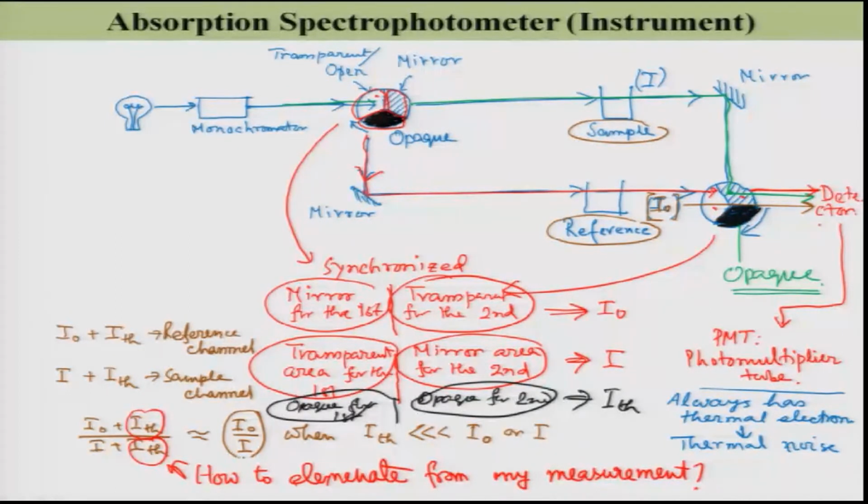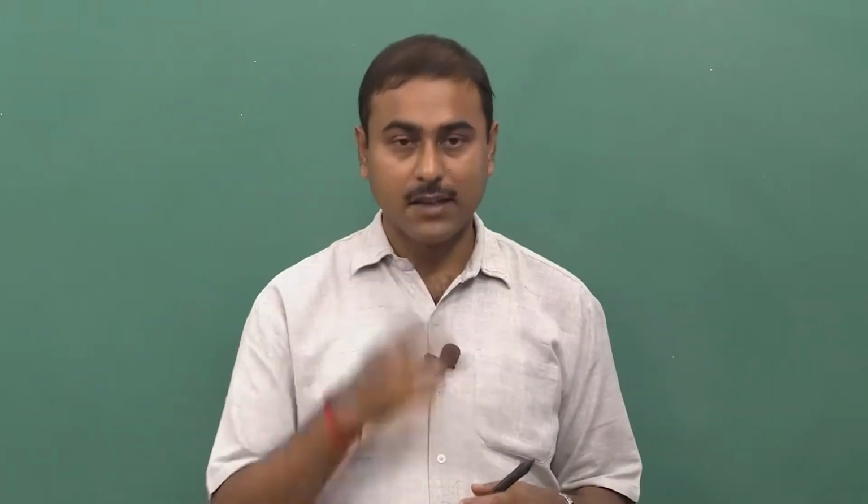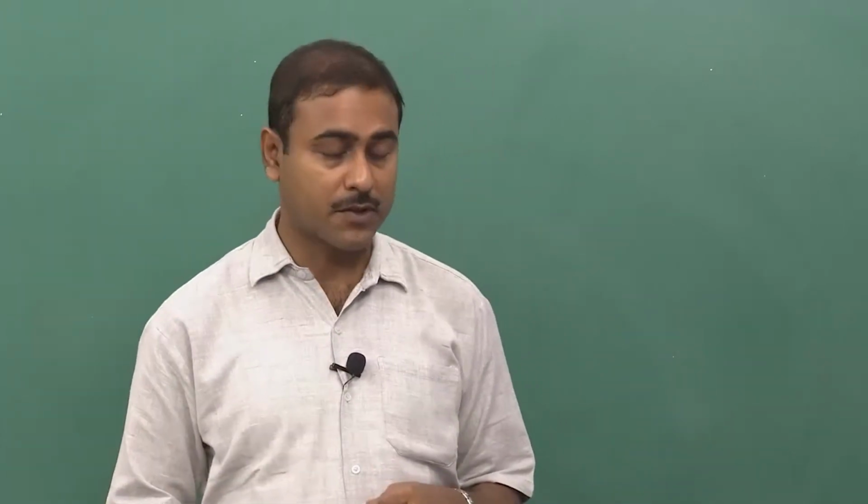Now, obviously, we have to move on, and before moving to the fluorescence spectroscopic part in more detail, let me show you one interesting application of this absorption spectroscopy, which will be required while we discuss solvatochromism in fluorescence too.